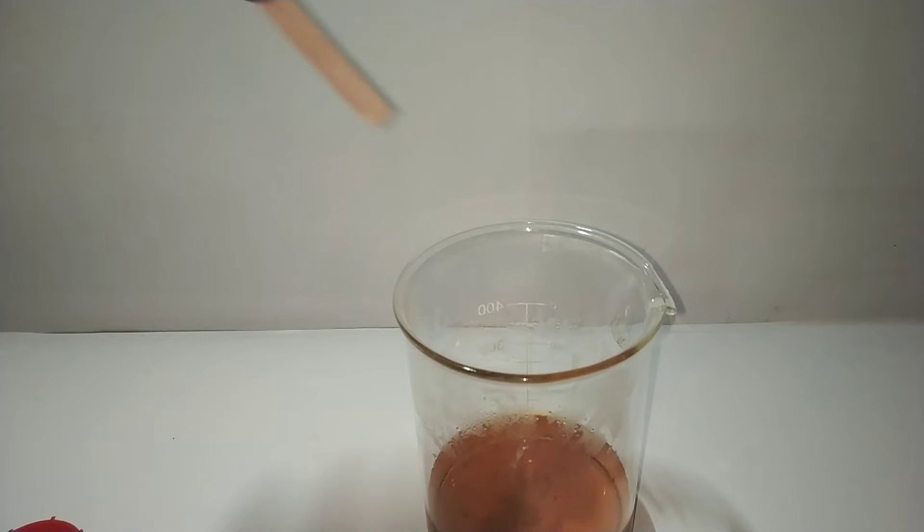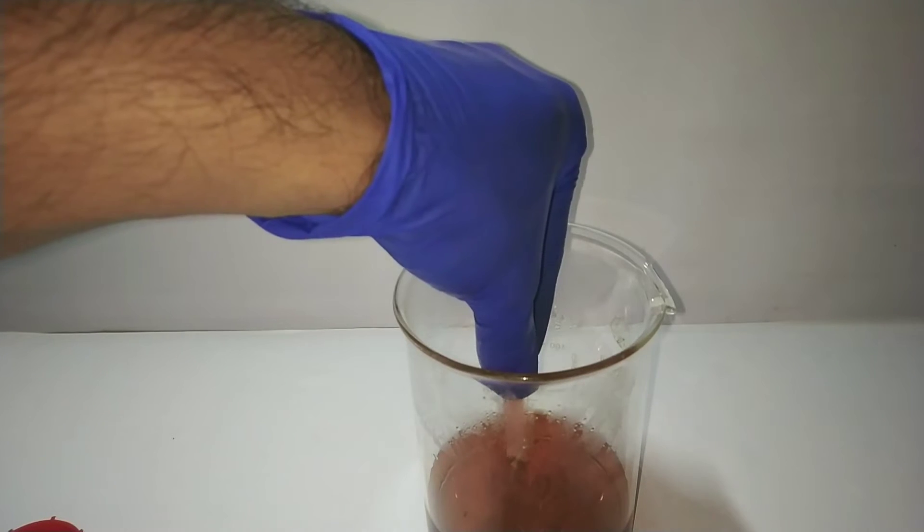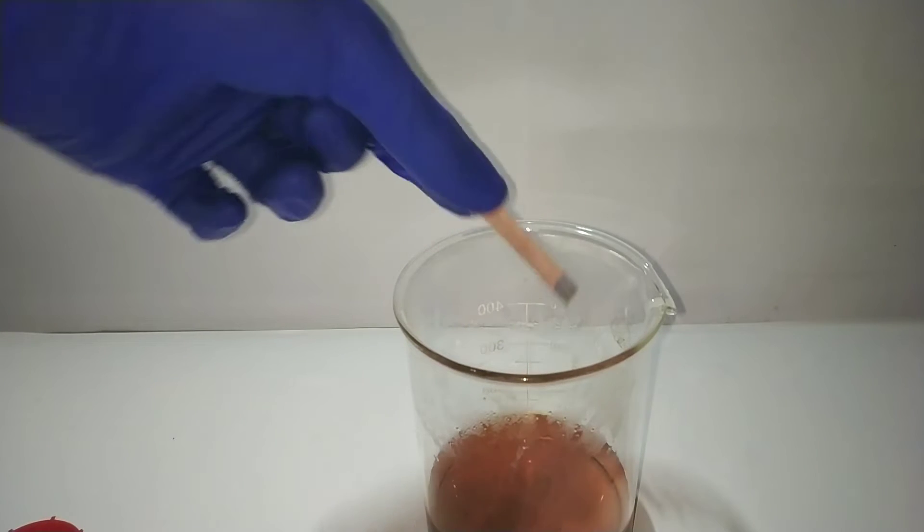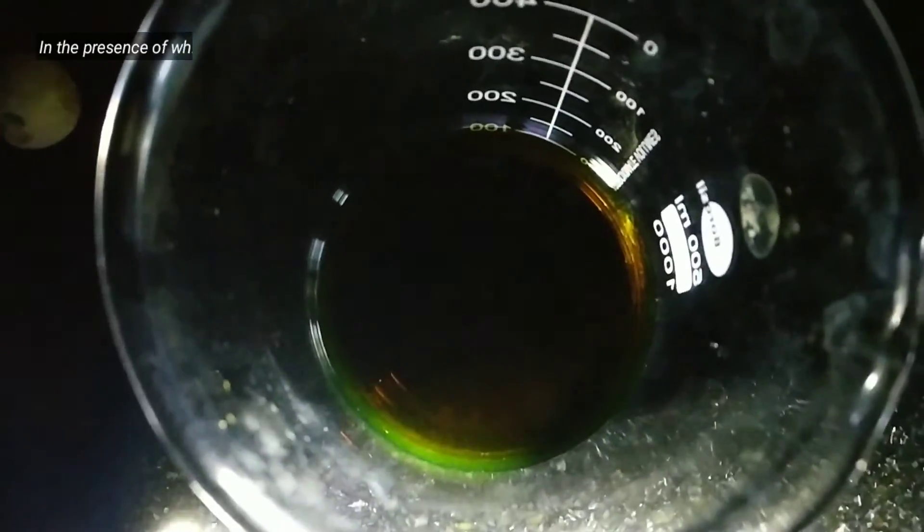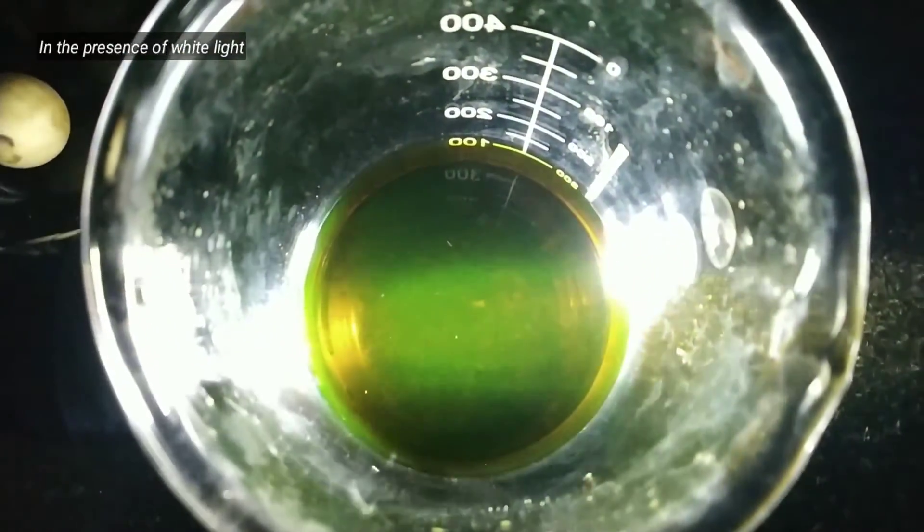We can test whether our resultant solution is alkaline or not by using a red litmus paper, and in this case it is alkaline as it turned blue. Now this solution has a high concentration of fluorescein in it.